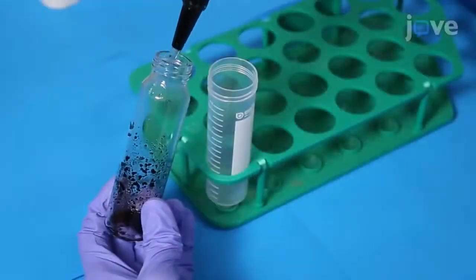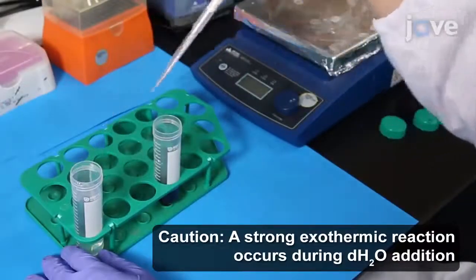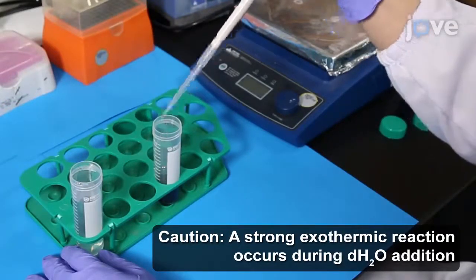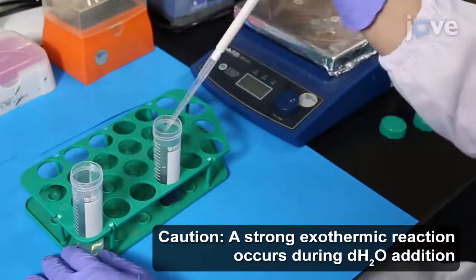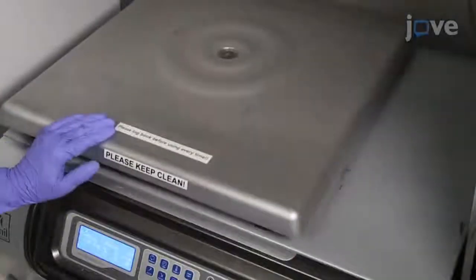Transfer the mixture to a centrifuge tube. Use a micropipette to carefully add 30 milliliters of distilled water dropwise to the carboxylic acid functionalized MWCNTs, pausing to allow the mixture to cool as needed. Then centrifuge the mixture at 12,000 g for 15 minutes.